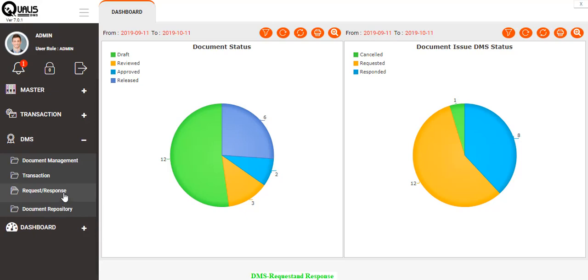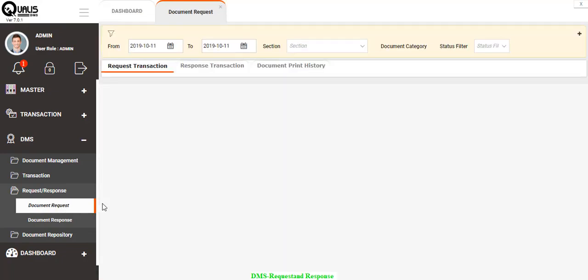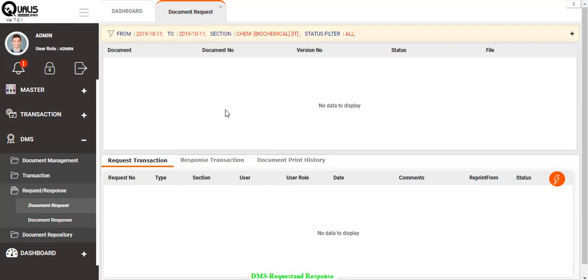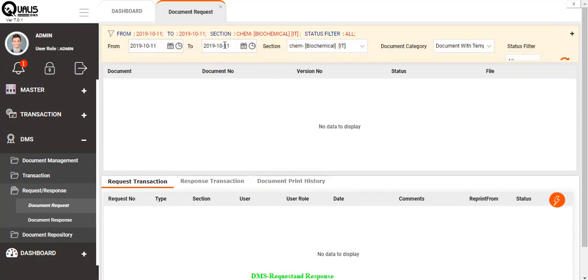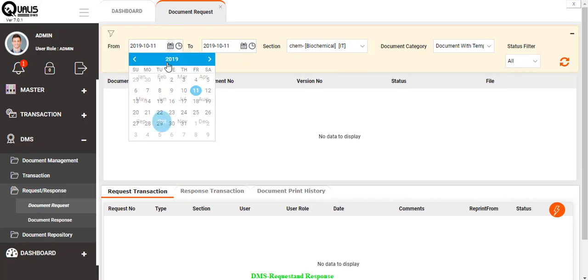As we discussed in the initial phase of the document management categories, when the document is created with the category template as yes, these documents are available for reprinting based on the batch record levels. For example, we talked about BMR and BPR records or the lab sheets. These can be reused again and again for a new record request. Here we can give access to the document request.